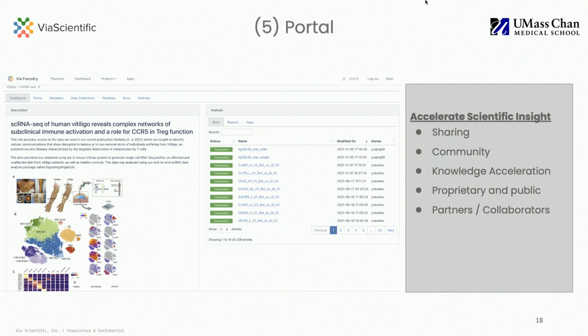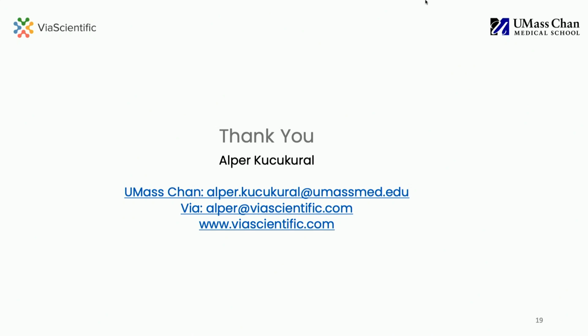You can access this portal to see what happened to your samples, what kind of samples you have. You can create summaries without writing code. You might have ENCODE functionality, but you designed all the metadata behind it. It's very flexible, and we are improving it and making it much easier for our users. I think that's all. Maybe if you have questions, I can take some.